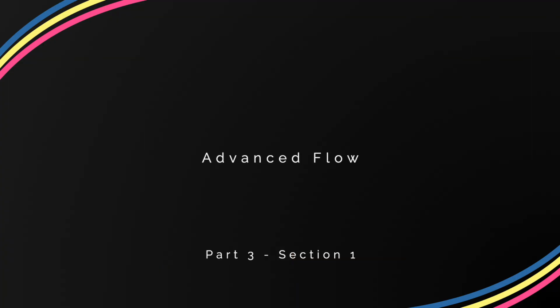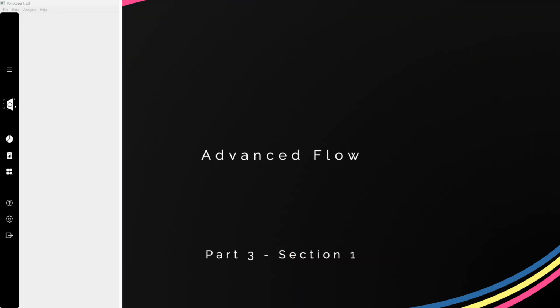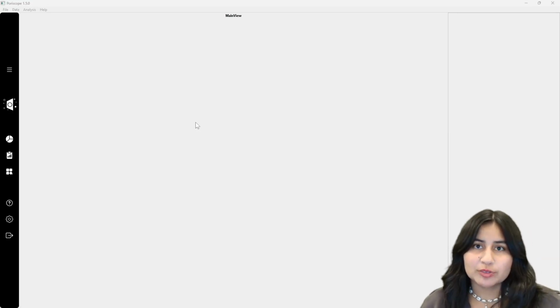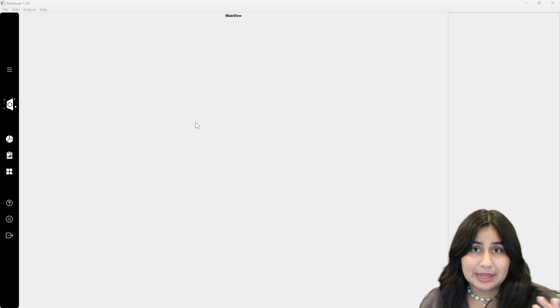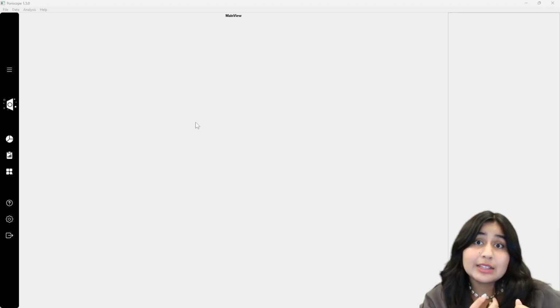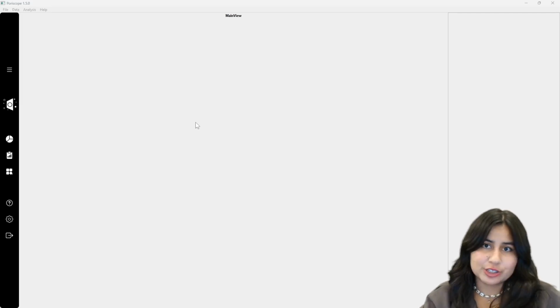But before we get to it, we're going to take a quick review of the workflow, starting with how the data flows from one step to the other. As we saw in part 2, Poriscope's workflow is divided into 3 main steps, followed by an optional 4th one: raw data, event analysis, metadata, and finally clustering.